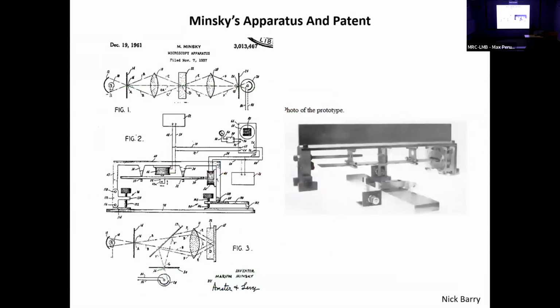That's what his microscope actually looked like. And it's a right contraption. Most of it is this whole gantry here, that's his scanner. So he's got basically the sample on these little prongs here. And he got two objectives. You can see there's the sketch of it from his patent.